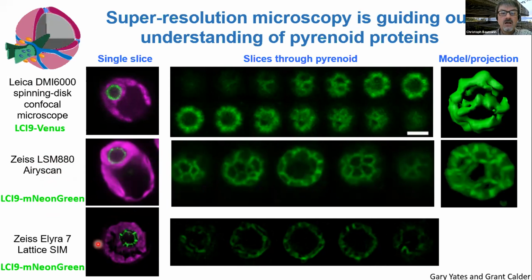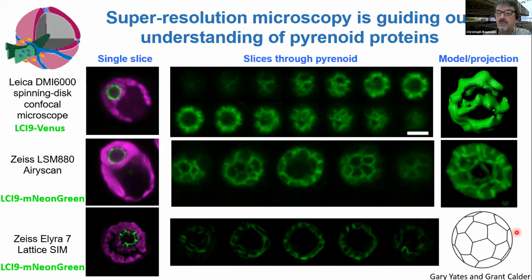The purple region here is about 10 microns in diameter. So this is basically 3D SIM imaging using the more traditional Z-stack mode for acquisition. They're in the process of building a model using this data, but it's very much something that gets kicked around on football pitches. It looks very much like a football in its arrangement.